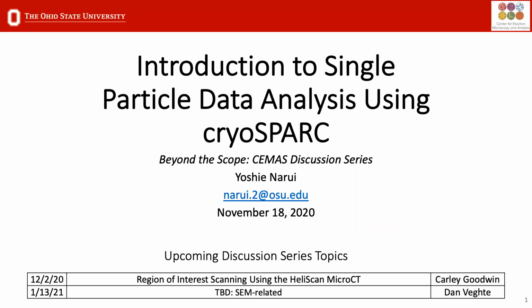To import the movies for any data set, but specifically for this tutorial, you need this information. This data set was deposited into EMPIAR, which is one of the databases for cryo-EM data. It's just the first 20 movies, so it's not the whole data set.